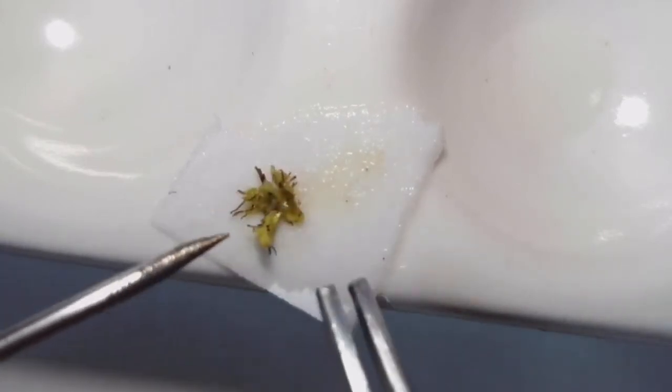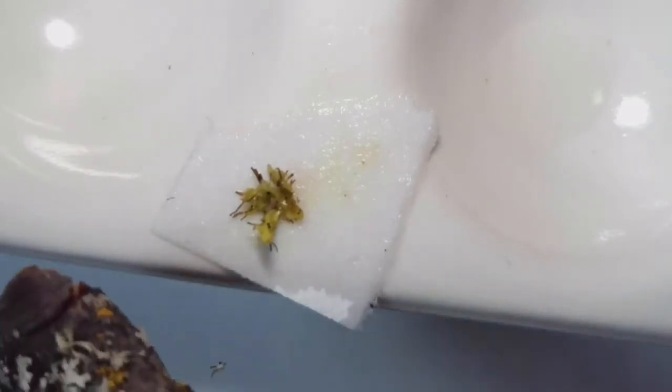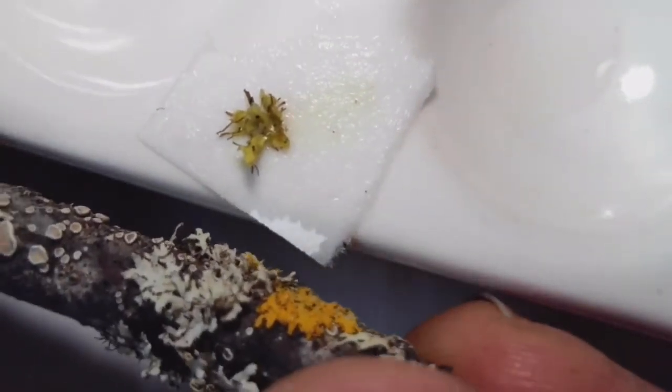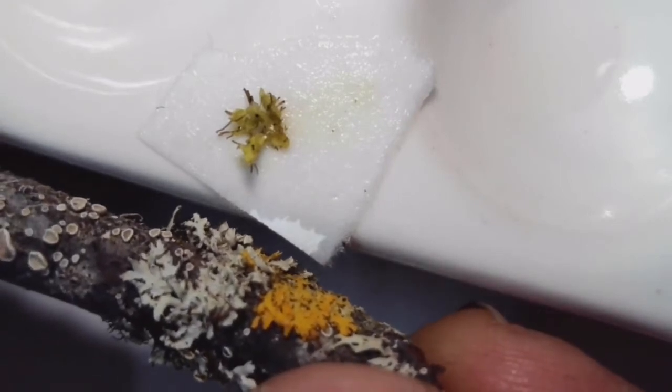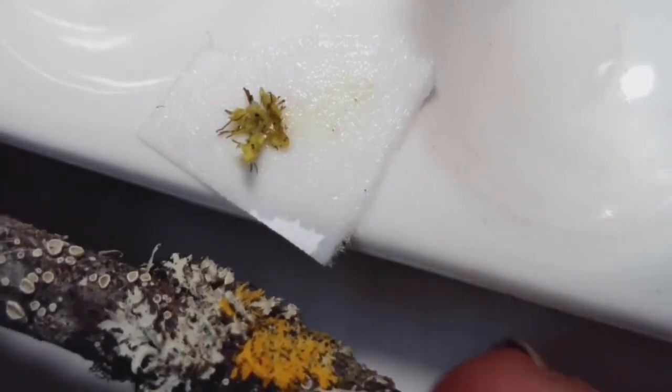And so with K, you want to wait for the lichen to take up the reagent, but you don't want to wait too long. So definitely with a lot of these, as soon as you add that substance on there, you want to watch it through time to make sure that you catch anything. So now the yellow is not quite as obvious. Sometimes it can be helpful to compare it to the original dry lichen itself. And if we're looking at the dry specimen compared to that, it is more yellow. And so that would be a K plus yellow reaction.